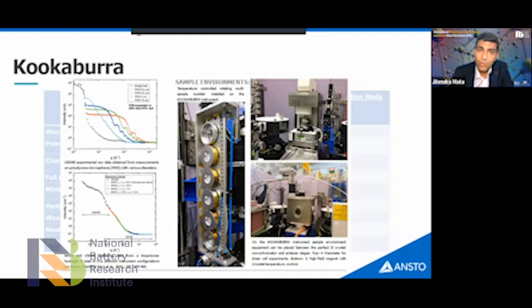If you remember that rocking curve I was mentioning, if you plot it in the log scale, it won't look like a peak, but it will look like this. So you have a nice empty fall down. And if you put the sample in, you still have this direct beam, but the fall down is different. This is a nice polymer particle, and because they are monodisperse, you can see these nice features coming. These are the different sizes of the particle, and you can convert this into Q value versus intensity and subtract this and get a really nice scattering profile.